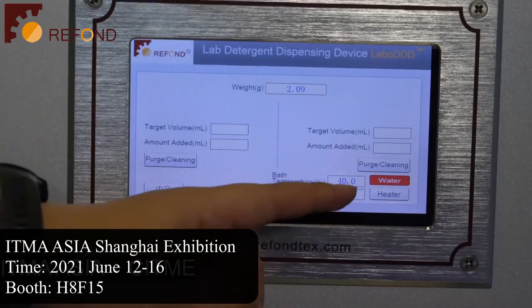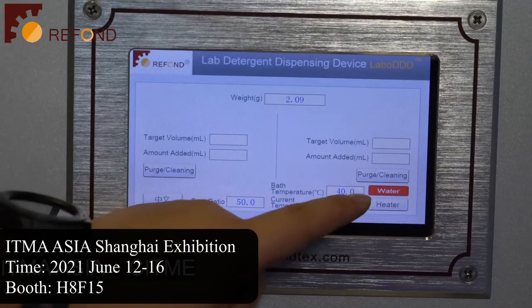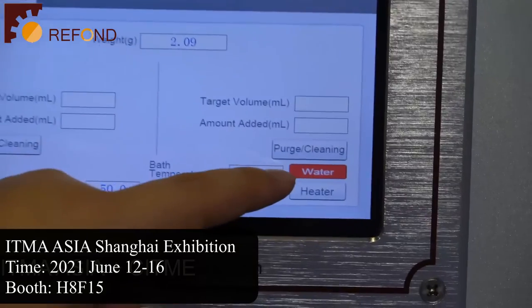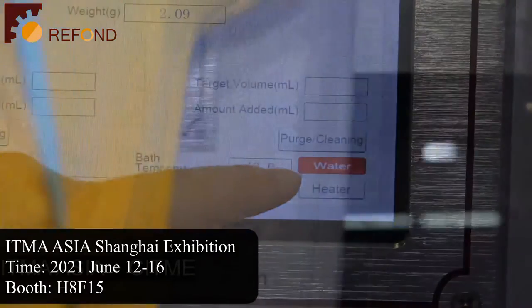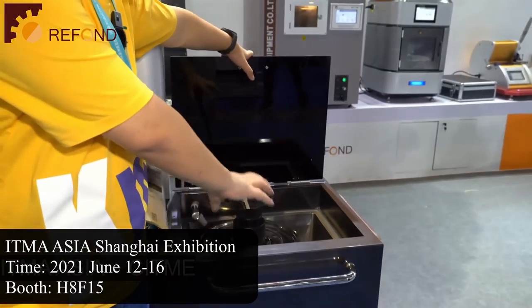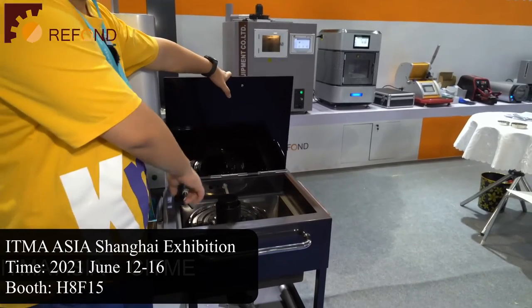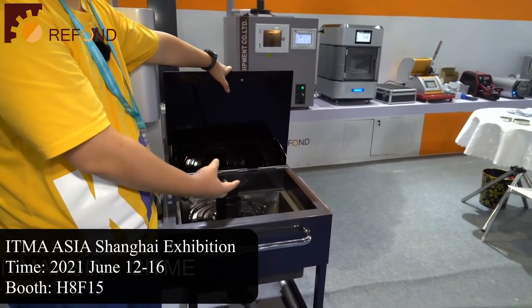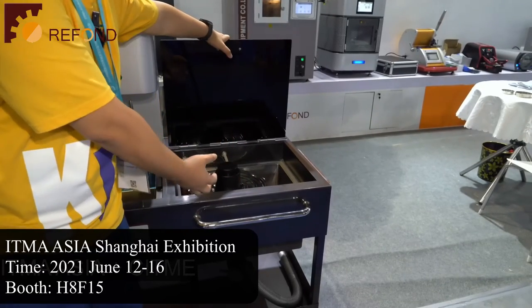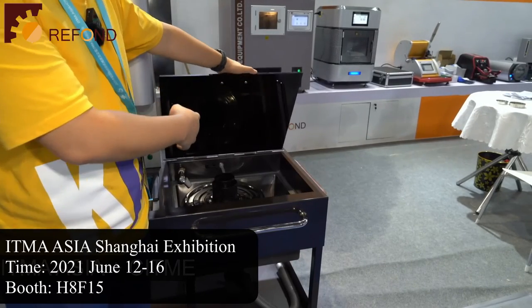Here, because at the exhibition we didn't add any water into the water bath, you will see a red sign indicating that there is no water, or not enough water in the water bath to proceed with heating. On the right side, since there is water around the detergent container, when the water level in the detergent container goes below the water level on the outside in the water bath, the container will float because of the buoyant force.